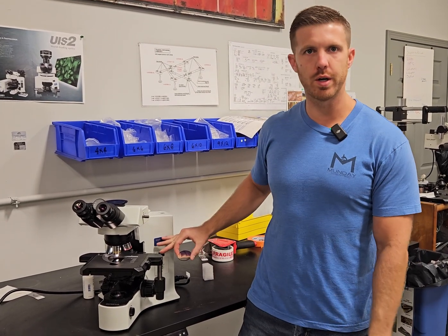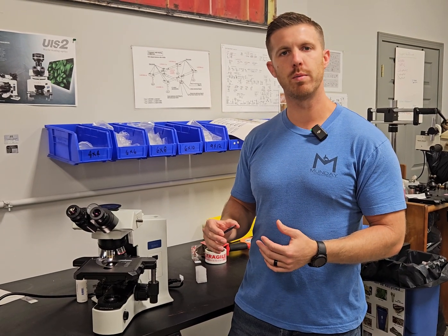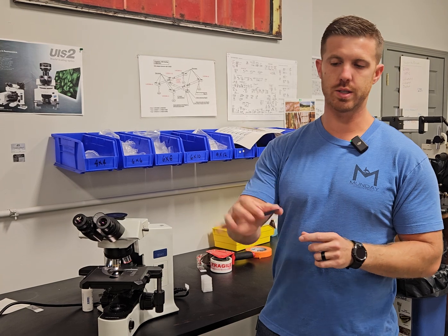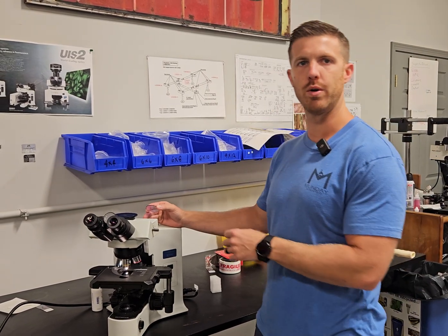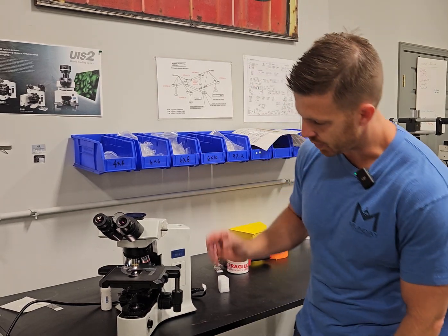So we have the Olympus BX41 here. You'll get a packet when you receive this microscope from us, or if you've already got it you can look for this item. It looks like a little mirrored piece of glass, but the purpose of this is the halogen bulb is going to burn more of a warm color temperature and you need to insert this.